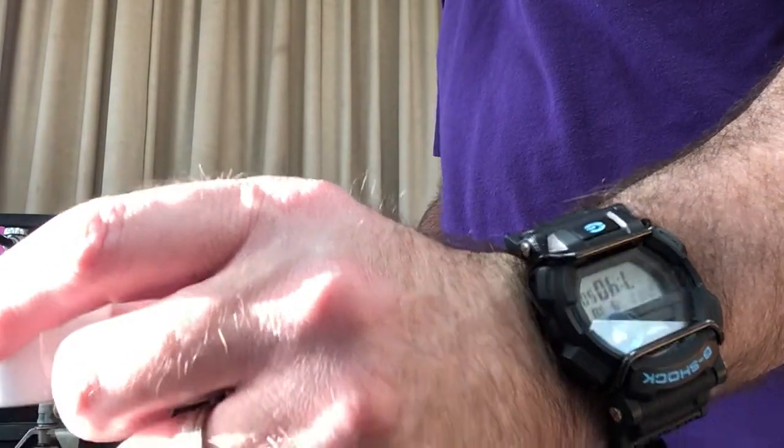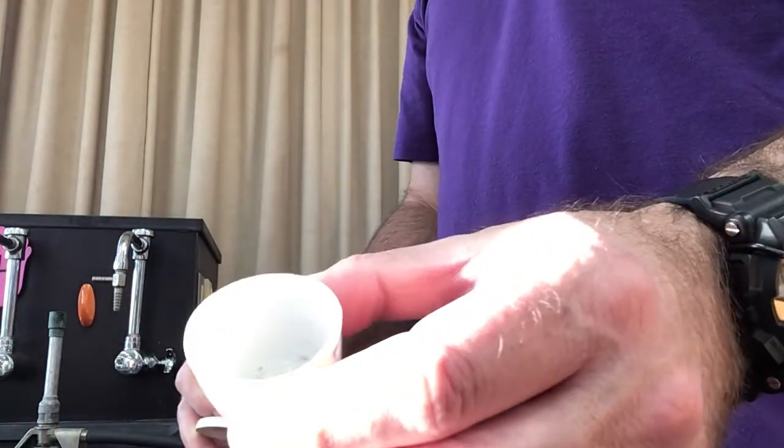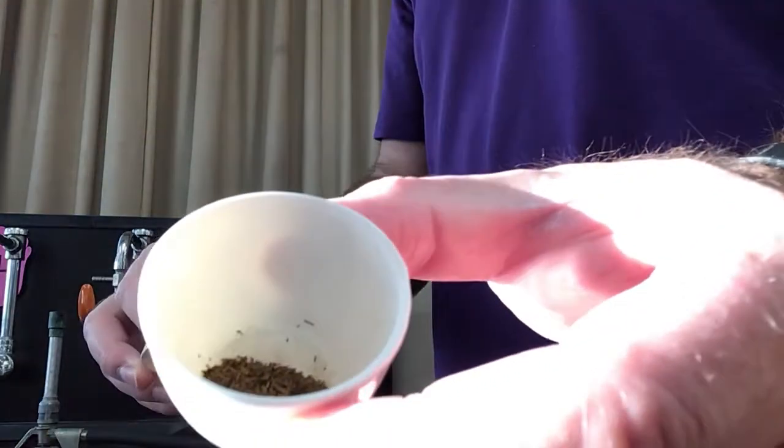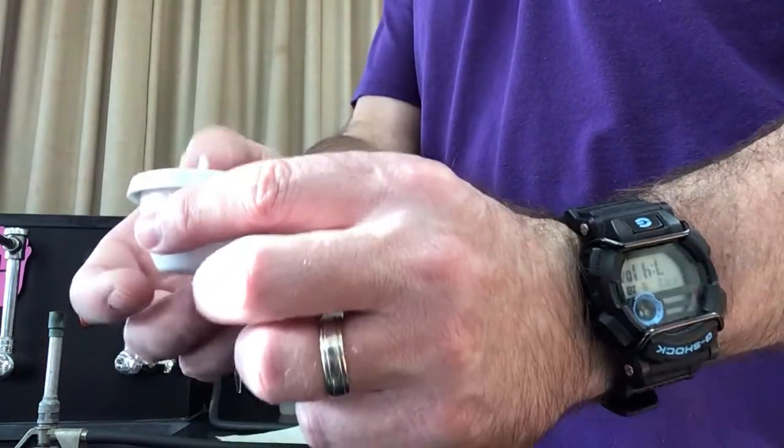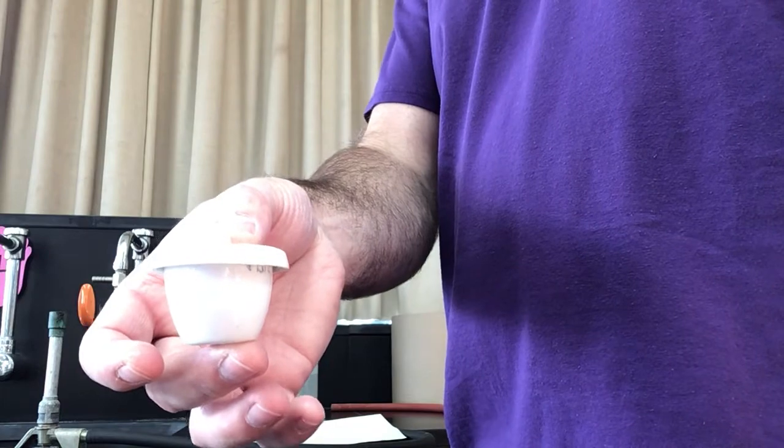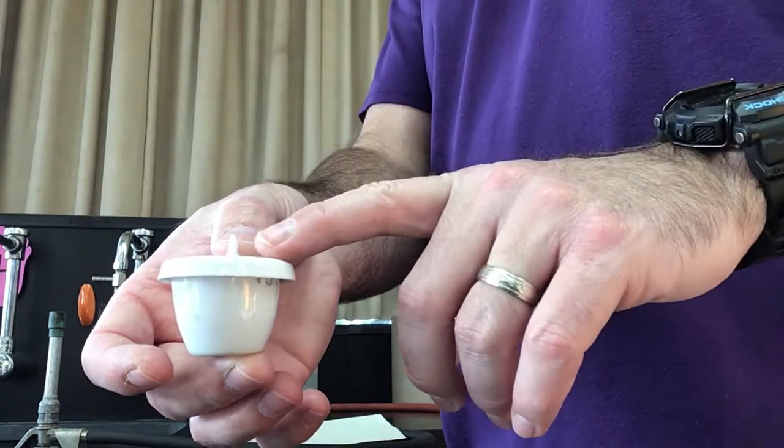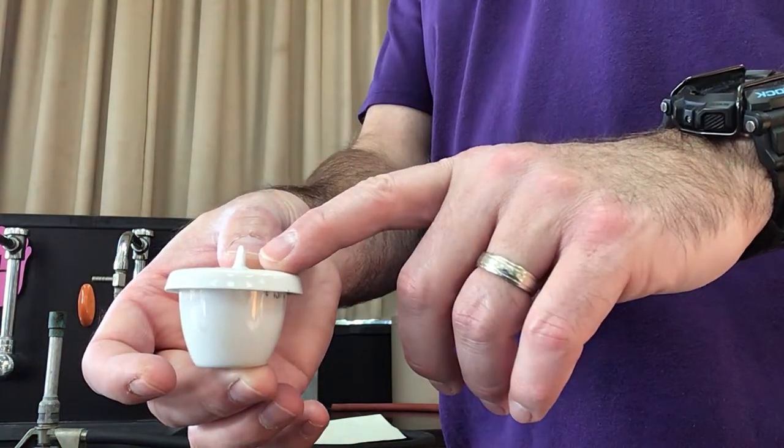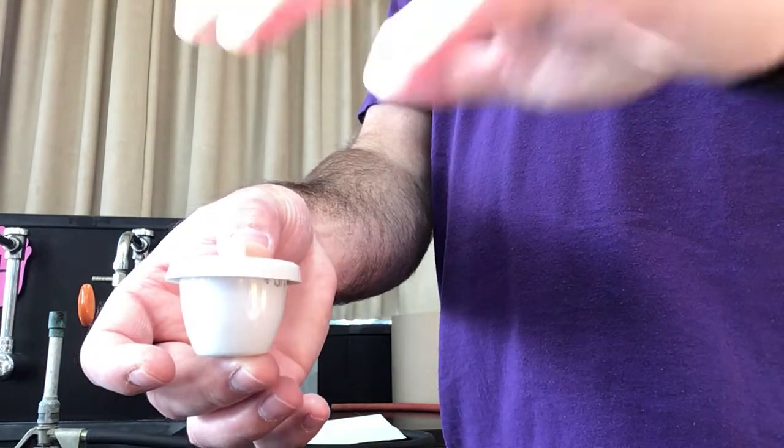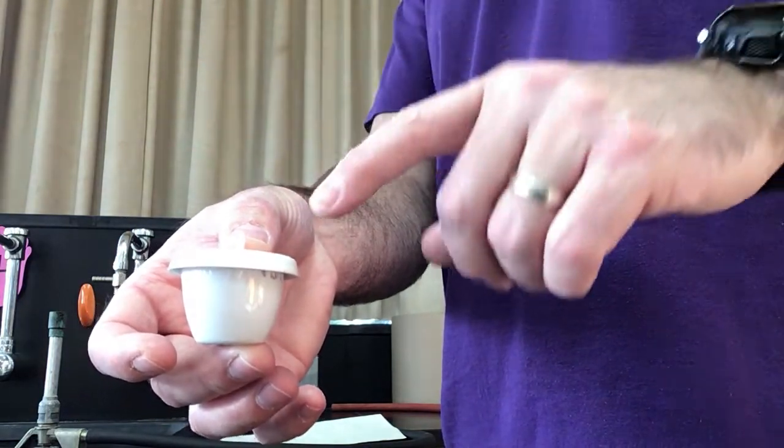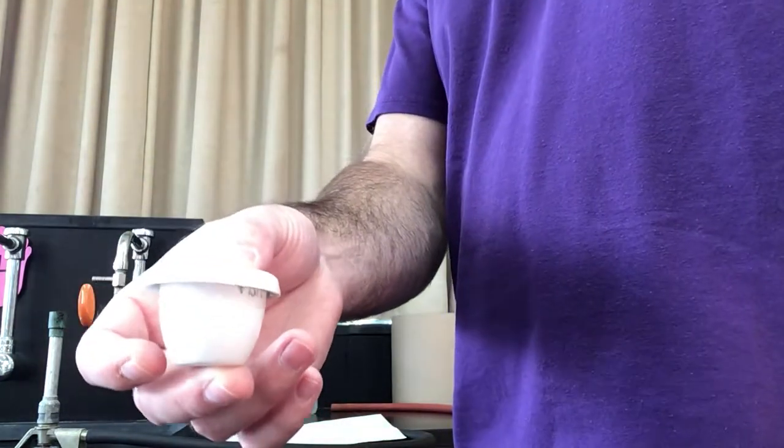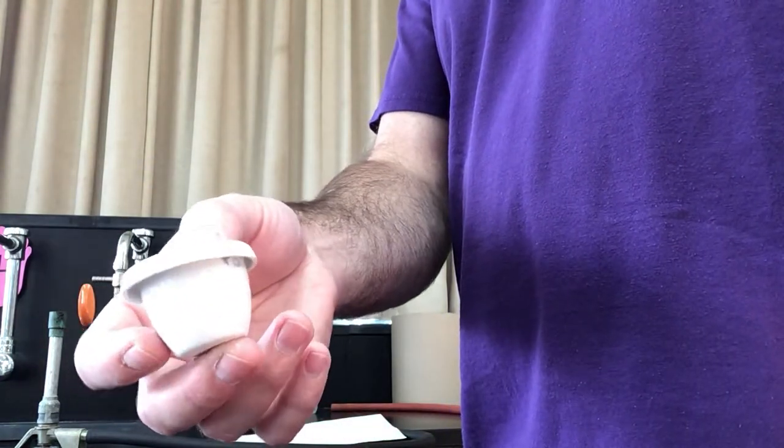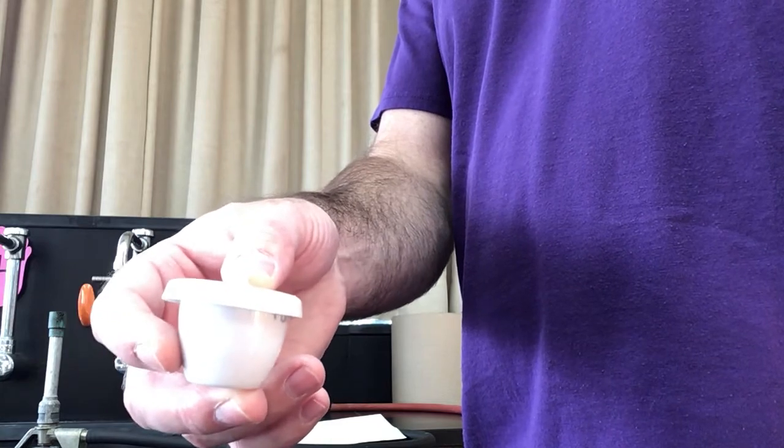The mass of my crucible plus the anhydrate was 11.48 grams. After heating it, the instructions said to cover it with this crucible top and let it cool down for about 15 minutes. The top is going to help so that the anhydrate doesn't absorb water from the atmosphere and change our mass.